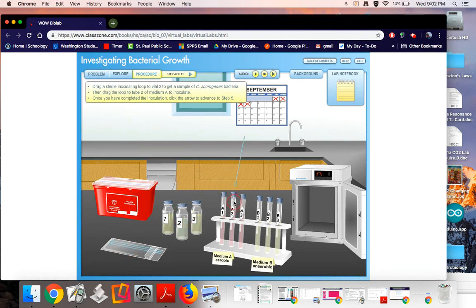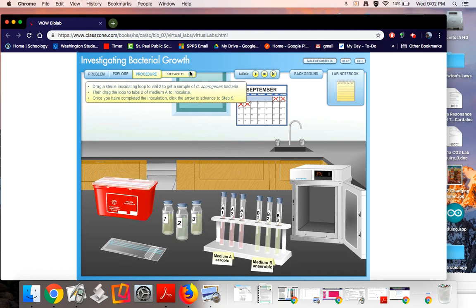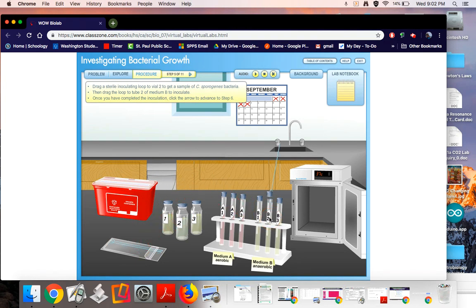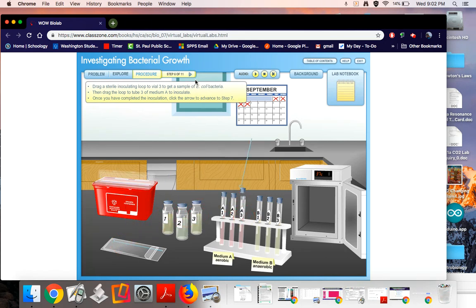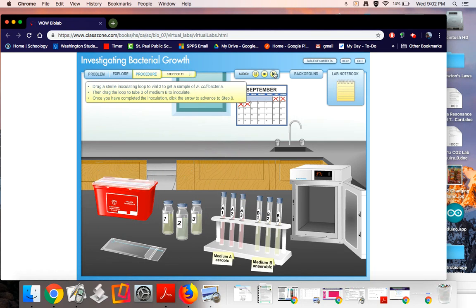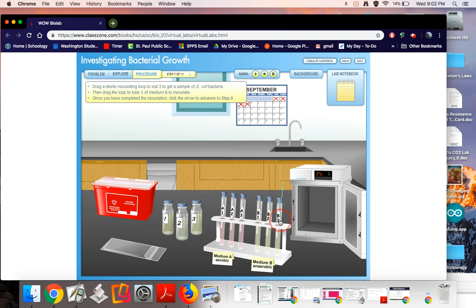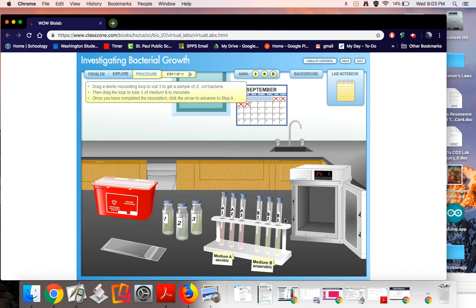Drag a sterile inoculating loop and then finally my third. Drag a sterile inoculating loop and now I've got all three bacterias in three, two different environments.